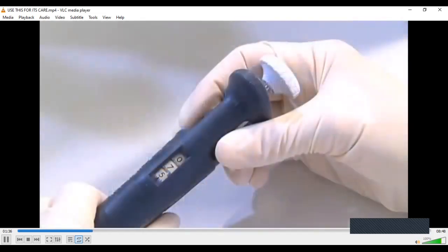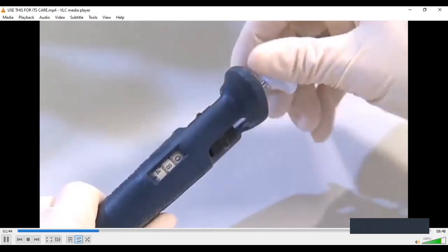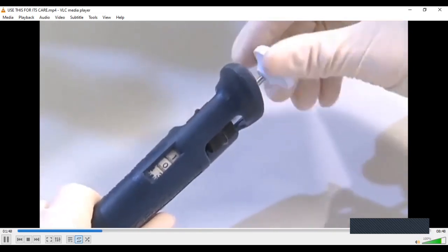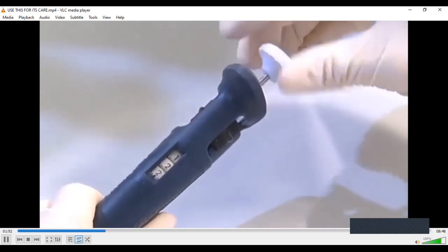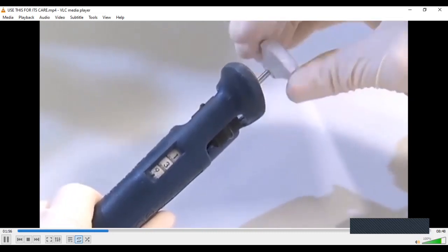Each pipette has a vertical row of 3 numbers visible in the body of the instrument. To set the volume, you can use either the thumb wheel or, on newer models, the push button. This will cause the 3 number dials in the body of the pipette to rotate and change the volume of liquid that will be taken up. However, the dial numbers indicate different volumes depending on which pipette is used.